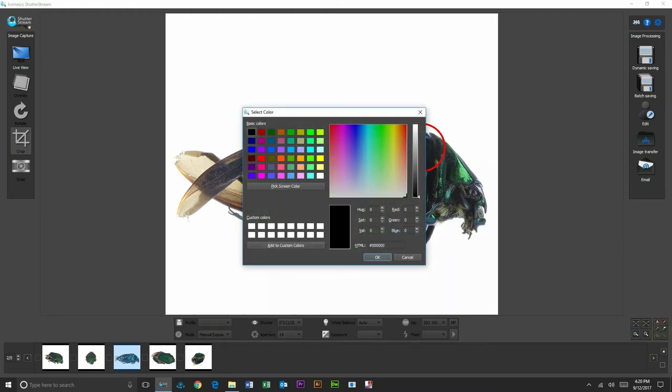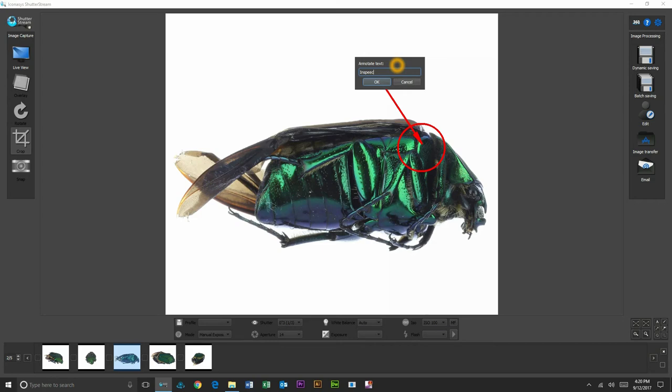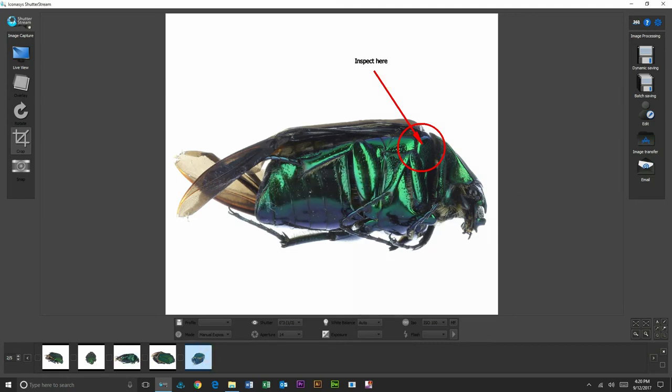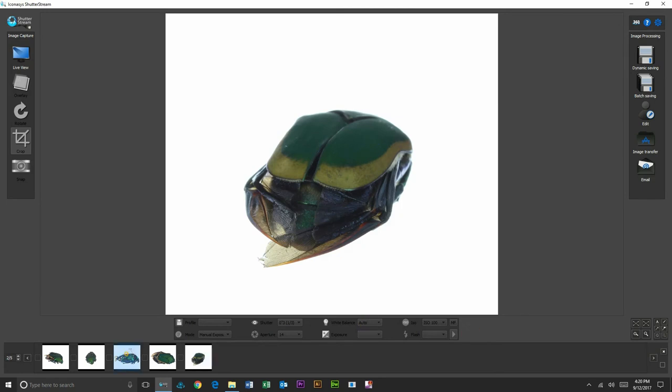Then we can write on here, 'inspect here.' So it's great for communication. We'll save those annotations on the image. Again, you can annotate on any image that is required.